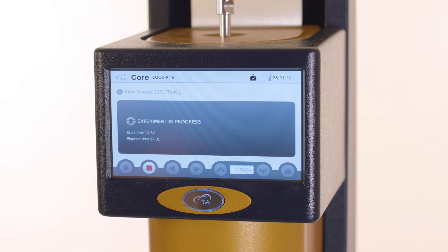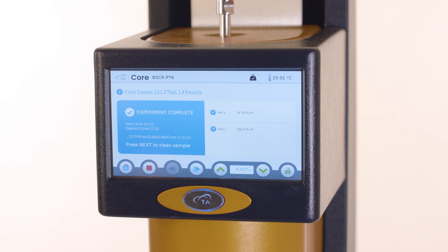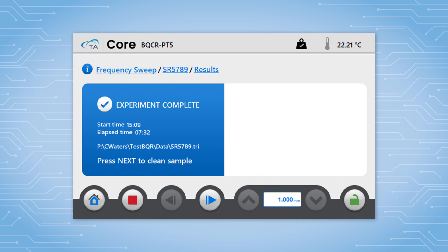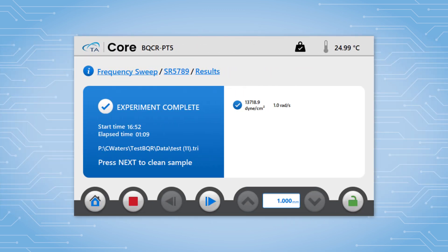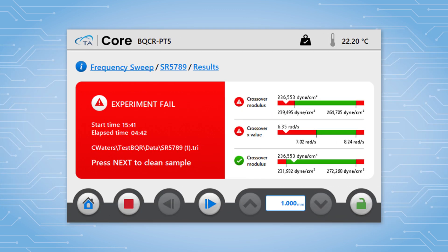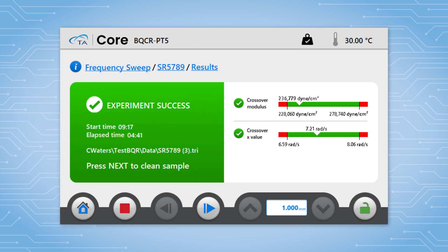When the experiment finishes, one of four screens will be displayed. If no end-of-test analysis is performed, a blue experiment complete screen displays. If an end-of-test analysis is performed but no pass-fail criteria are defined, then a blue experiment complete screen displays with the result. If an end-of-test analysis is performed and at least one result fails, then a red experiment fail screen displays with the results and acceptable ranges. If an end-of-test analysis is performed and all of the criteria pass, then a green experiment success screen displays with the results and acceptable ranges.